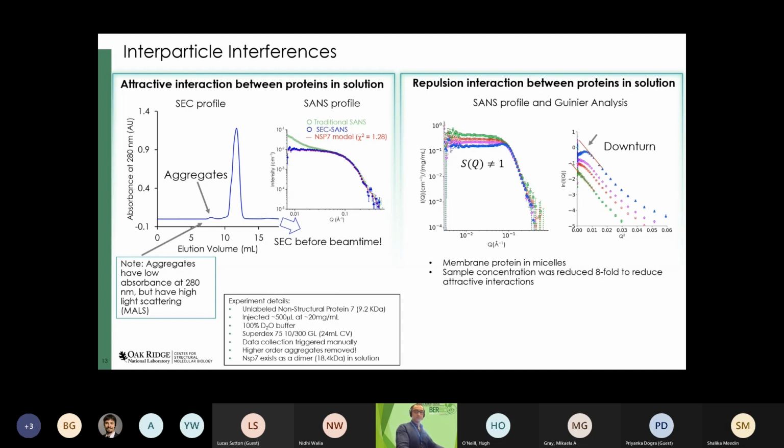The question is: is it possible to determine the molecular mass of the polymer shell in a core-shell particle? I think that would be tough, right? I'm thinking about the conditions. You basically would need to know the volume occupied by the shell and the density of the polymer in that shell, and then you could figure out the mass from there. But I think it would be complicated and hard to do. I'm not sure you'd have the resolution in the measurement to get an accurate value.